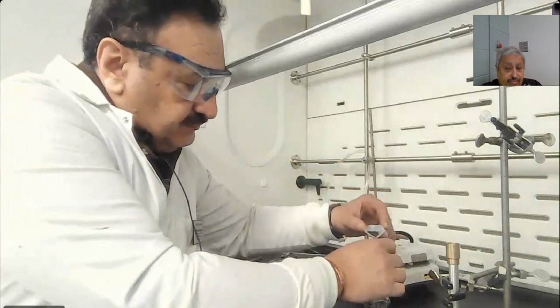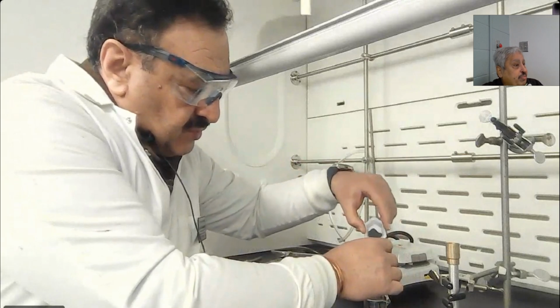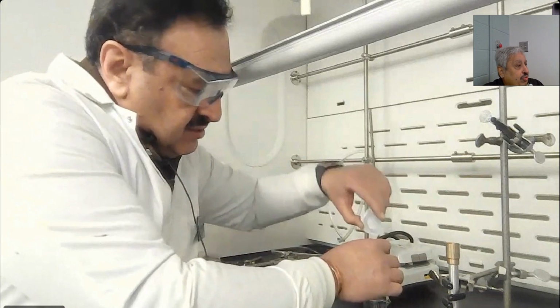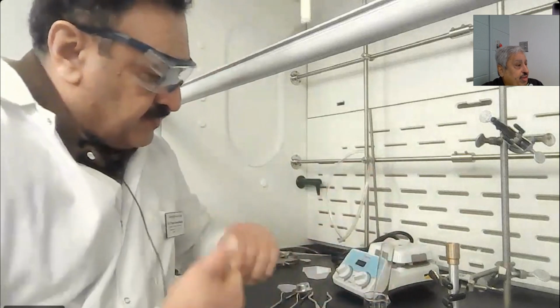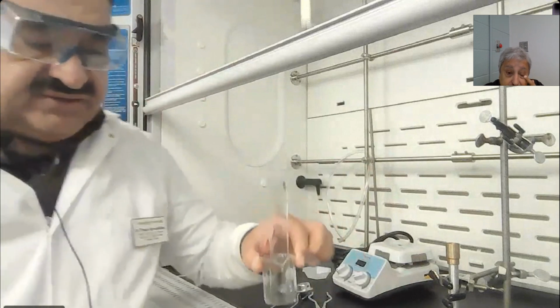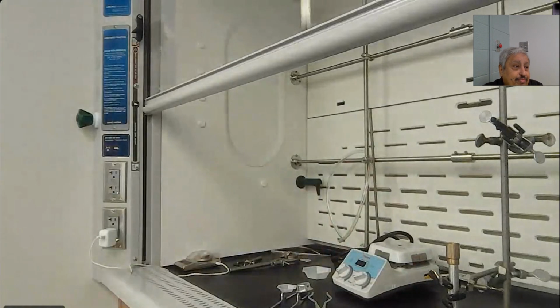So he wants to show me the experiment. He weighed double, 1 gram, but in the procedure it is half a gram, to show me the whole thing and proceed faster. So he used half of the time. Then you weigh the beaker and the test tube with the manganese dioxide.